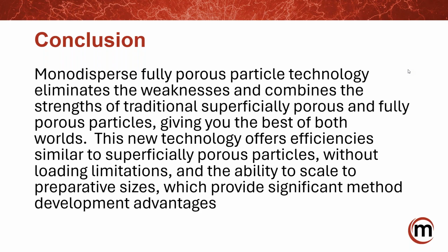So silica in general has pH limitations above pH 8, and as you go to higher temperature, you want to be careful there. The C12, we've seen it stand up in ammonium hydroxide for 10,000 column volumes, which is pretty impressive.